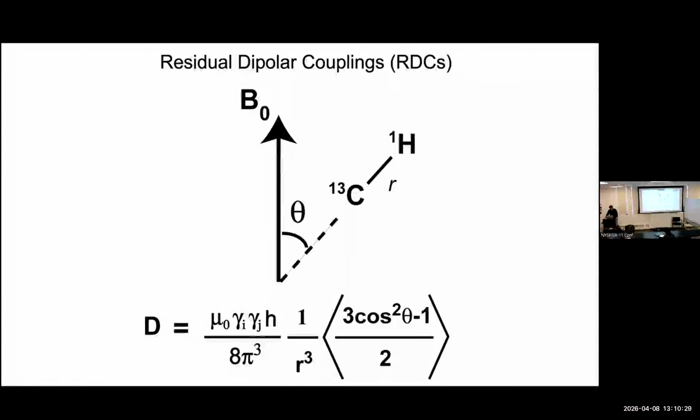Great. So, all right. As I was saying, these two lectures are meant to describe applications of NMR to nucleic acids, but because nucleic acids are in many ways unique molecules, some of the most critical applications involve a technique called residual dipolar coupling measurements, which I would like to introduce today, because it's so central to anything we do with nucleic acids, and not only in my lab, but more broadly.